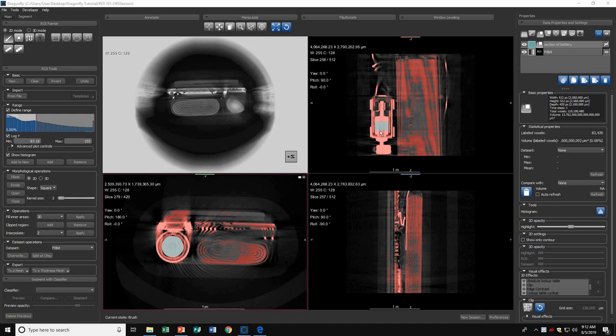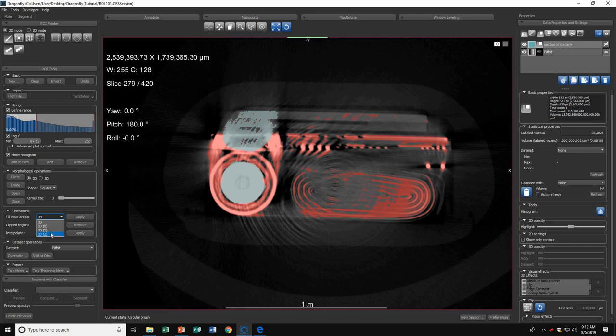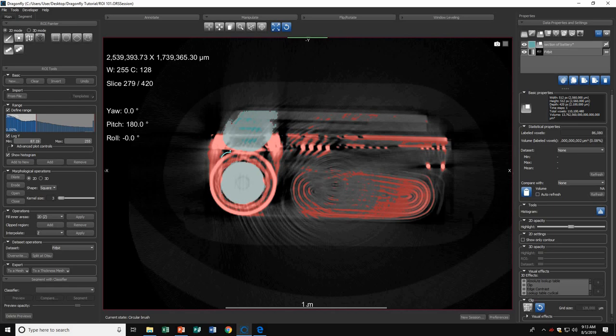Another useful tool is the Fill Inner Areas tool. Let's go into this slice and highlight this section. Now that I've highlighted it, I can use the Fill Inner Areas tool. I'll put it on the z-axis and hit Apply. Now you can see Dragonfly has highlighted all the area inside my painted region that is not within my range.